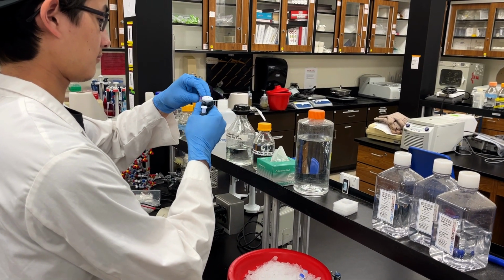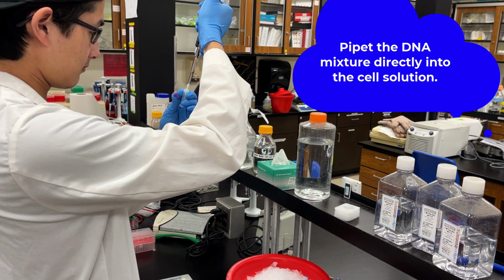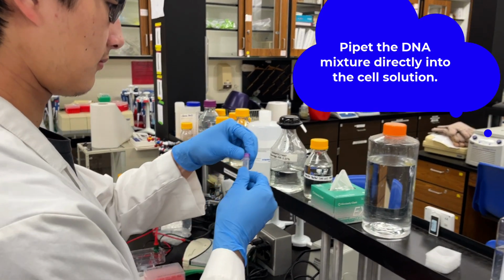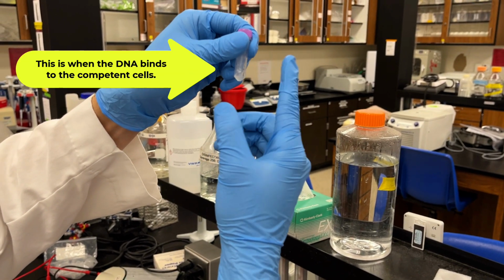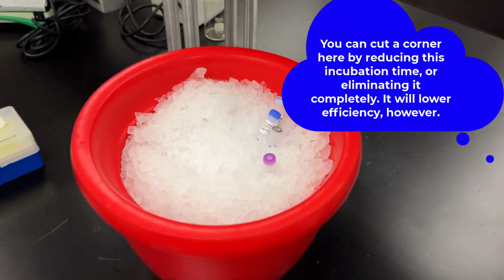Now notice after he pipettes, you do just a gentle mix. You don't want to go a crazy flick mix. Just tap the sides of the tube. Definitely no vortexing. Just a bip, bip, bip, something like that. And then let it sit on ice. 30 minutes, longer the better.